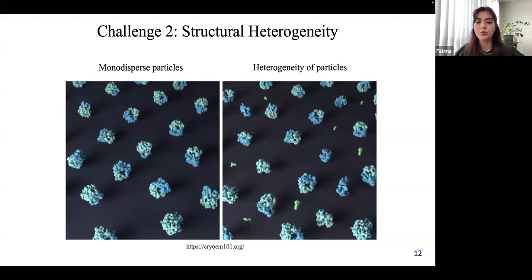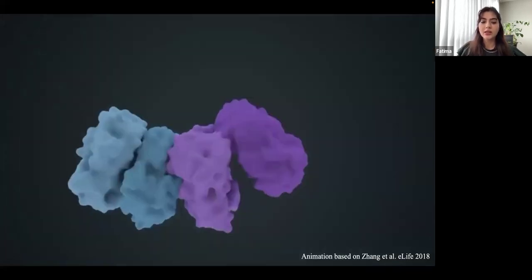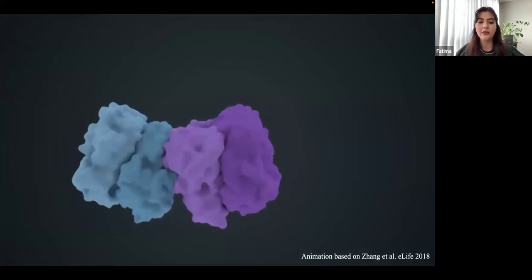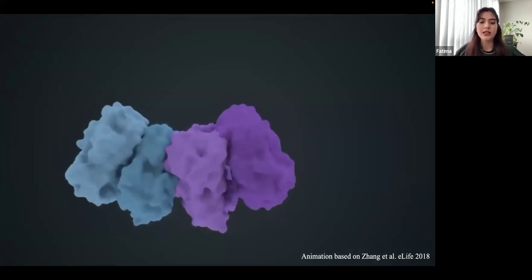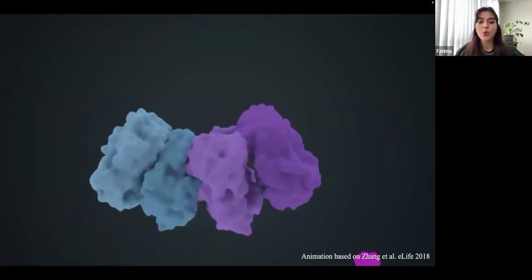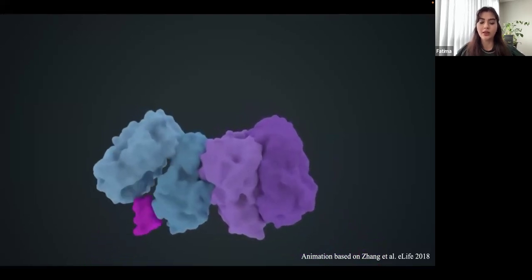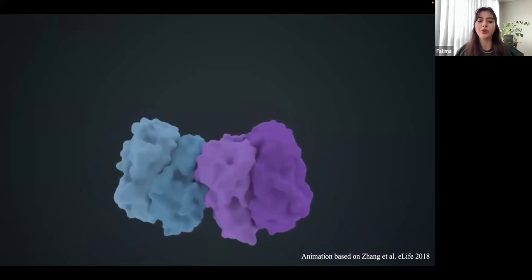So what we need to do before doing any cryo-EM process and experiment, we need to purify our sample with some chemical experiment. Another thing is some of the protein has flexible domain. That means their movement also makes some heterogeneity in our image. So what the scientists do is use small molecules, inhibitor, cofactor, or anything that can stabilize our protein and make it a good particle for the imaging process.